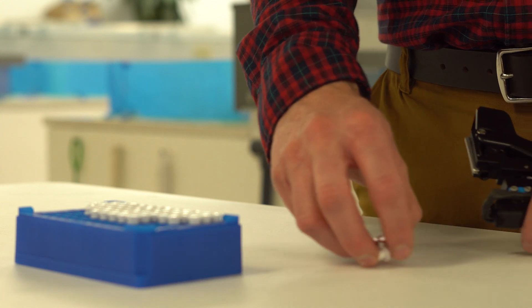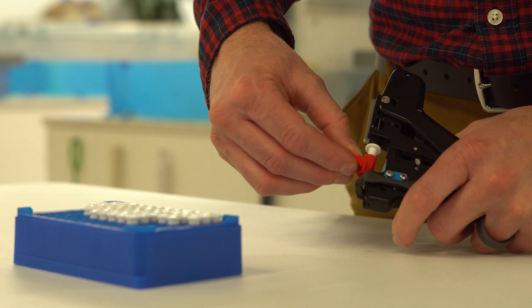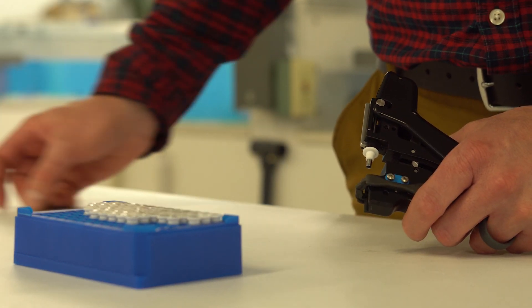To begin, place the punch into the applicator. Depress the trigger to set the punch. Remove the red safety clip by gently pulling it down and away.